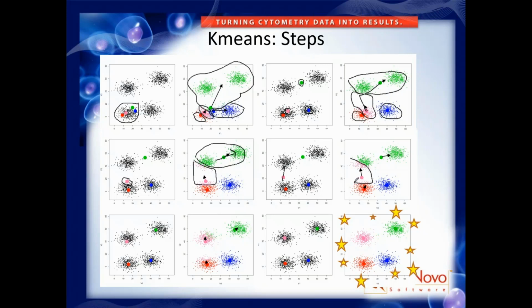And now, in fact, there's very few cells in the bottom cluster of cells that are closer to the pink centroid. Almost all of the bottom cells are now closer to the red centroid. And so basically the pink centroid is being drawn up more and more. The green centroid is being drawn to the right. And then eventually, if you repeat that, you get that the centroids moved to the centers of those four clusters.